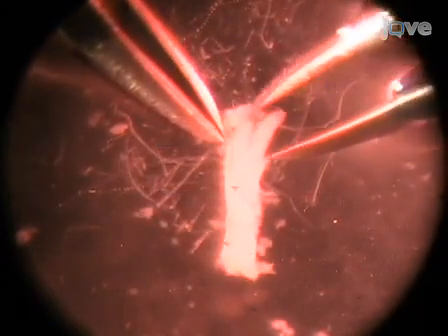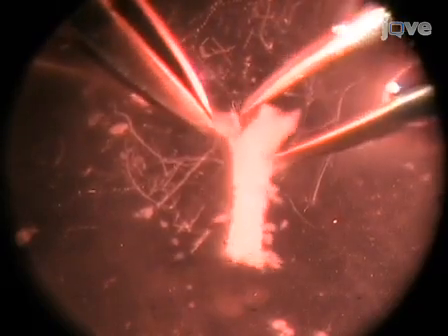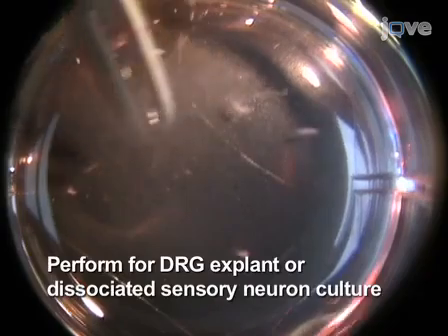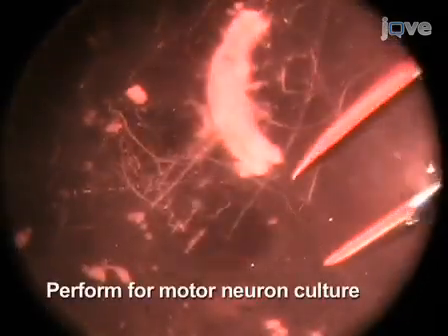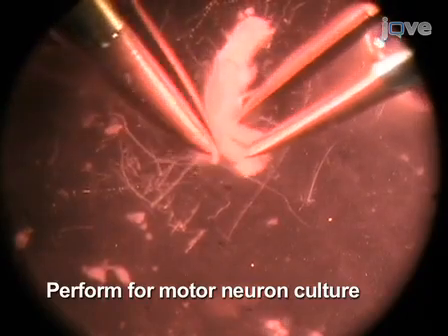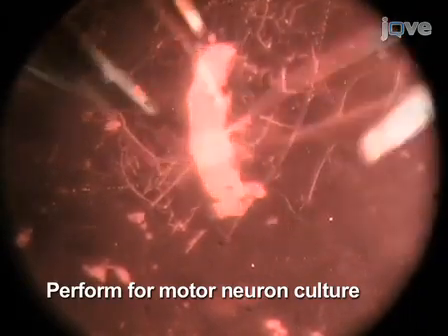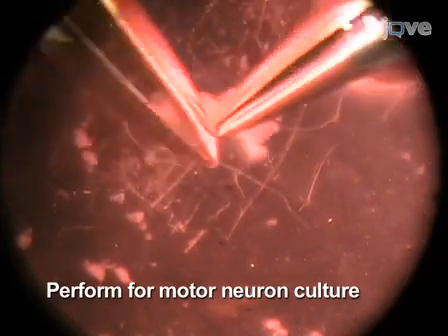If a dorsal root ganglia explant or dissociated sensory neuron culture is to be performed, snip the dorsal root ganglia off the cord and transfer them to a fresh dish of warm L15. For motor neuron culture, grasp the membrane from the spinal cord at the anterior end of the cord and peel it down, similar to removing a long sock. Repeat this process for all of the embryos and then, using forceps, chop the cords into small pieces.